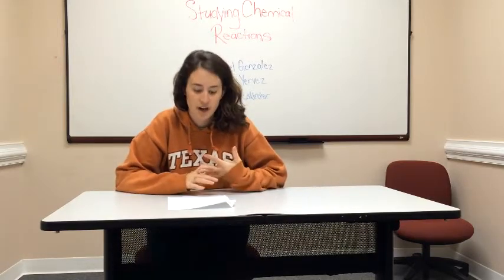This experiment was very time-consuming because it mixed many different solutions with many different compounds. But the experiment was very successful at demonstrating how some solutions could be highly reactive and others not, depending on what they were mixed with. This experiment also showed different chemical changes such as color change, precipitate formation, and formation of a gas. This experiment concluded with the observations being compared with the theory, and some reactions didn't have any chemical change at all, which was expected.